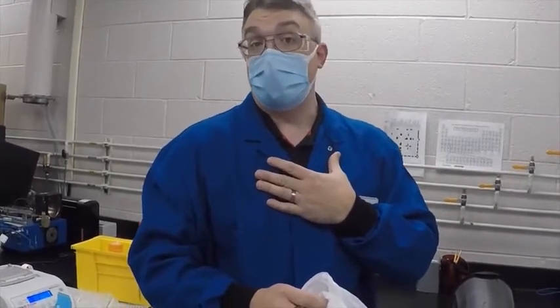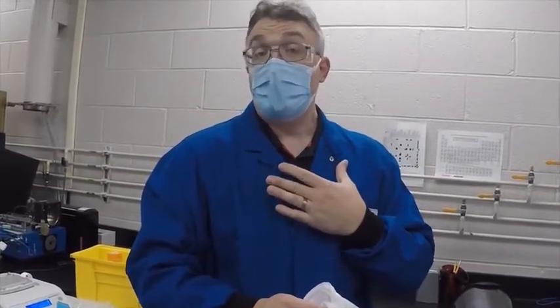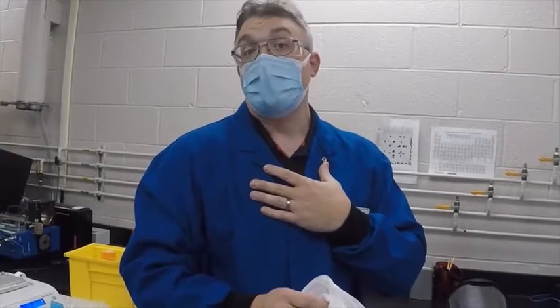Your reusable lab coats will need to be laundered. Typically we wear these for a couple of days if they don't get soiled with chemicals. As soon as it becomes soiled with chemicals, it needs to be laundered. Make sure you separate it from general laundry and inform your laundry provider that the coat has been soiled with chemicals so it can be treated properly. If it becomes too soiled, it might need to be disposed of entirely.